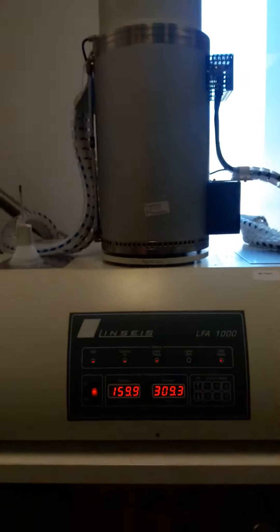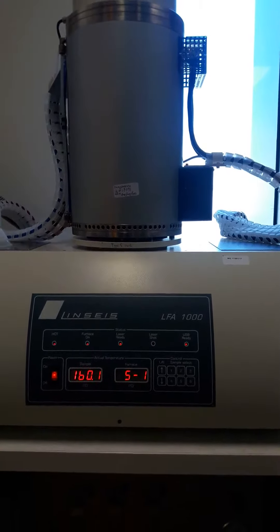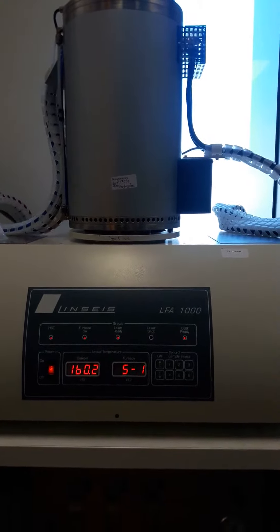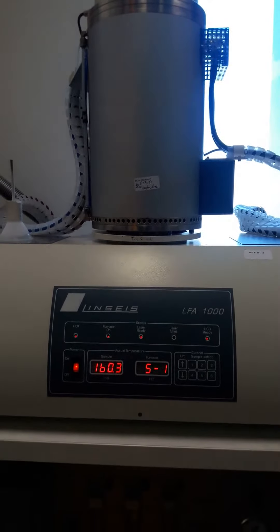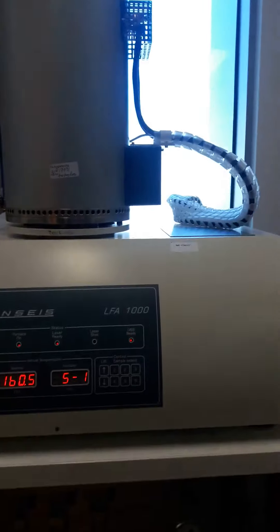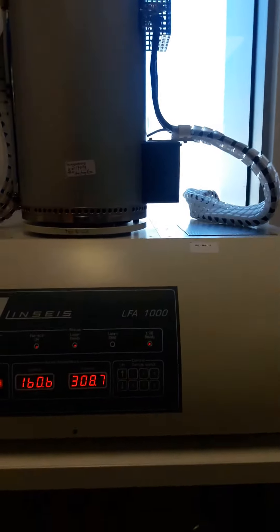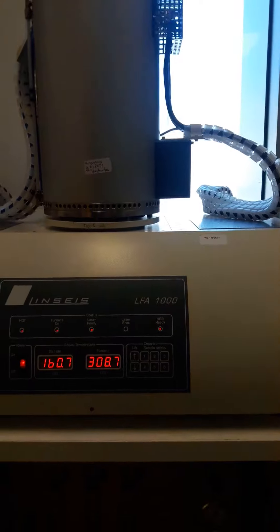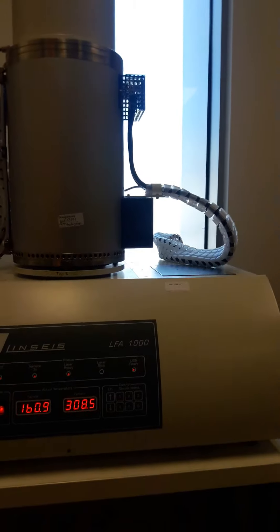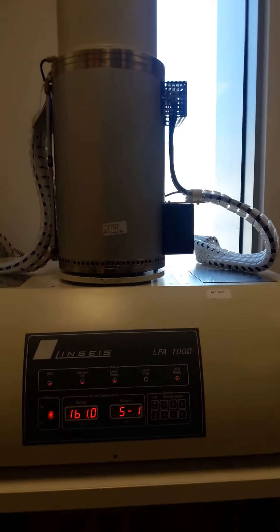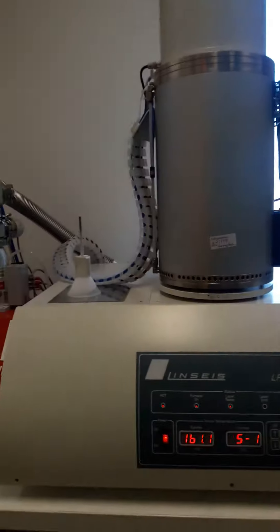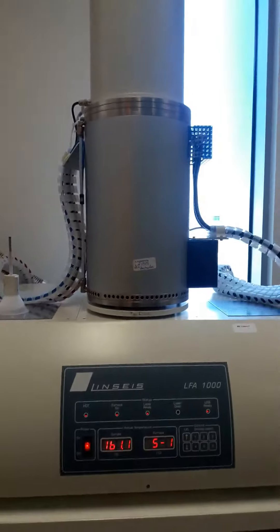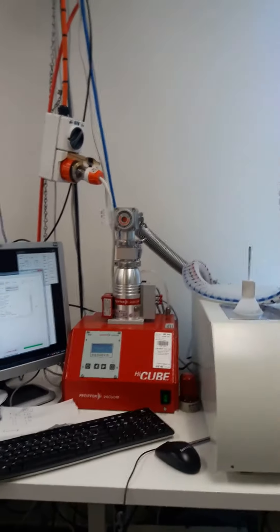Here you can see the temperature of the furnace and temperature of the sample. You can measure six samples at a time. Now I am going to show you the other parts. This one, the red one, is the vacuum pump of the machine.